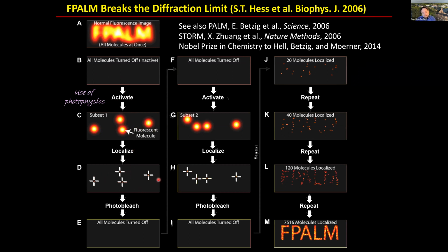And from those images, the positions are determined, and the molecules are then bleached, and another subset is processed in the same way. And we accumulate more and more subsets by acquiring more and more camera frames of different molecules until we can reconstruct the structure of the sample, but now not in a way that's limited by diffraction only, but rather limited by the localization error and the number of individual localizations, or the density of localizations within the structure we care about.